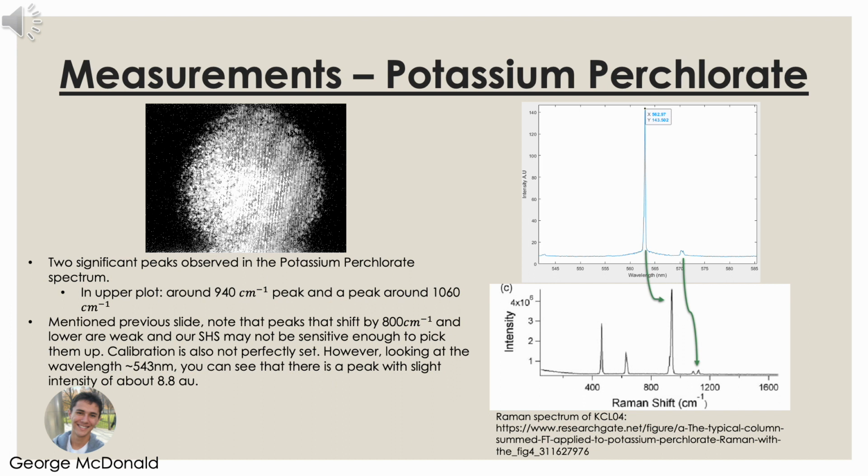that shift. So the Raman shifts that we can pick up are the 1000, or in this case I believe it's 940 inverse centimeters, as well as the 1060 inverse centimeter peak. You can see the doublet on the bottom right of both plots. We have some arrows pointing from peak to peak, so we can pick up the 940 inverse centimeter peak pretty well, and the doublets are appearing pretty well as well.